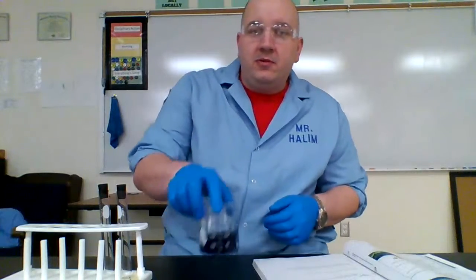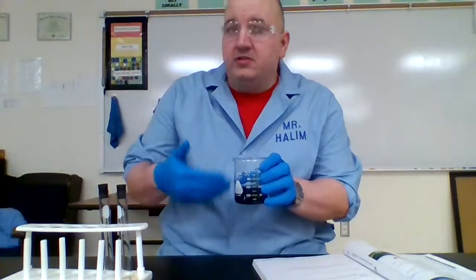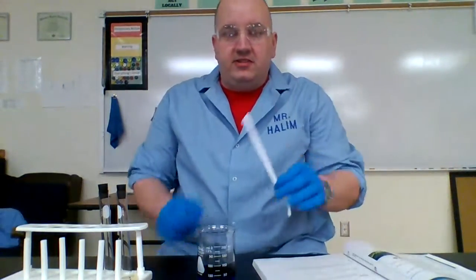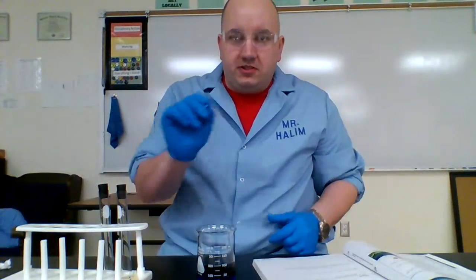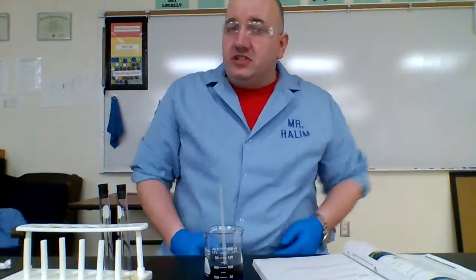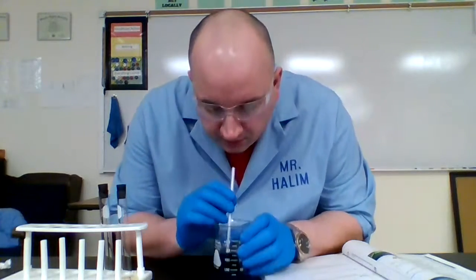So next thing, bromethymol blue is an indicator. As you can see now, it is blue, but when we introduce carbon dioxide into it, it will turn yellow. So in order to do that, you're going to need to go get a straw. You'll have to designate one person in your group that is going to exhale through the straw into the solution. While you're doing this, please be gentle. Do not blow forcefully. Blow very gently. And when you need to inhale, remove your mouth from the straw. Breathe to the side. Do not inhale through the straw. So take it very gently, and you need to start blowing in there.